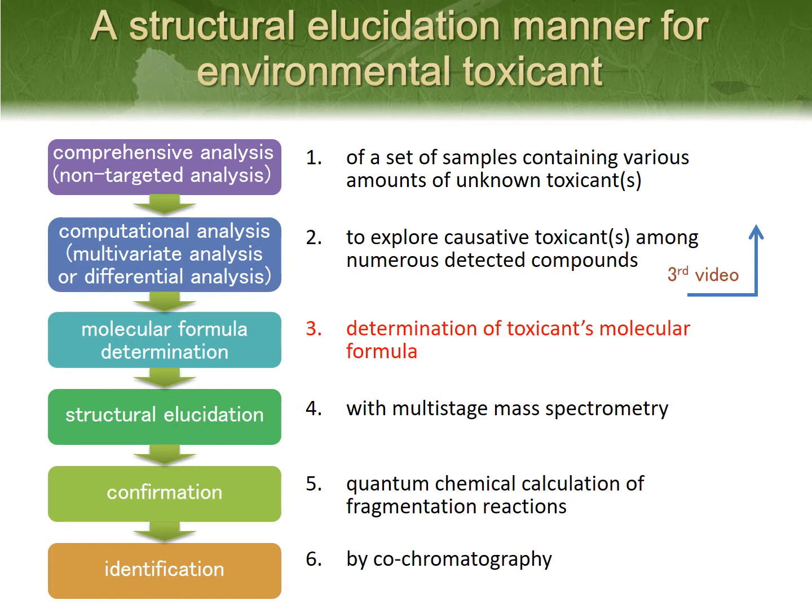In the third video, our structural elucidation manner was introduced like this. Among these 6 steps, the first and the second steps were already explained in the third video briefly. In this video, the third step, the molecular formula determination step, will be explained in detail.